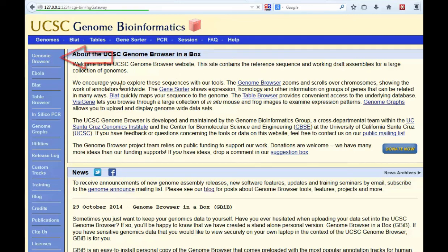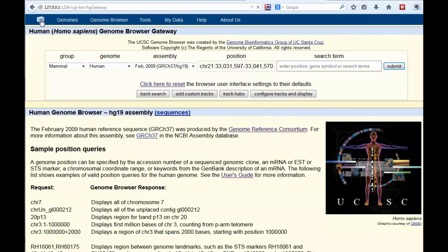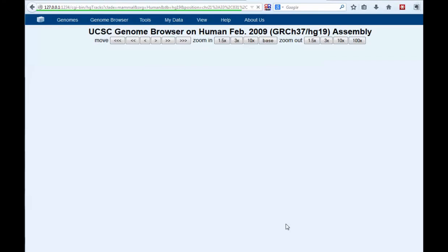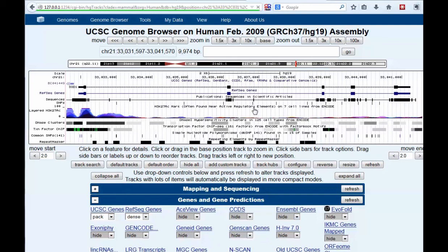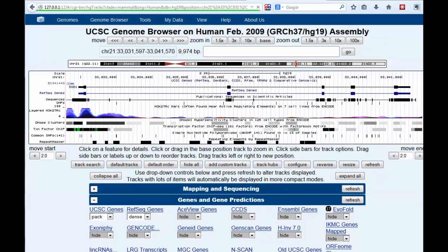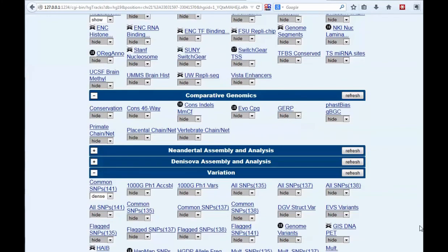Click the link that says Genome Browser here. You will have access to the same types of tools that you are used to seeing when you get to the Genome Browser on the web. I'll just click the default setting to show you that. It looks like any other browser. It does have the reminder that you're on the VirtualBox. Here I am loading the default tracks that are available from the VirtualBox, all happening locally — looks like the browser you're used to.